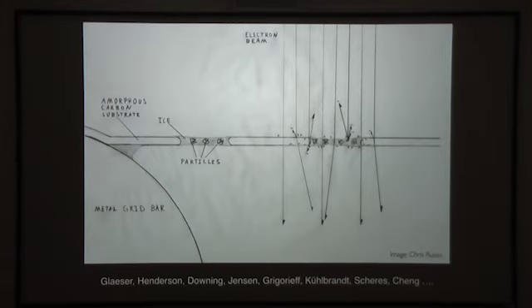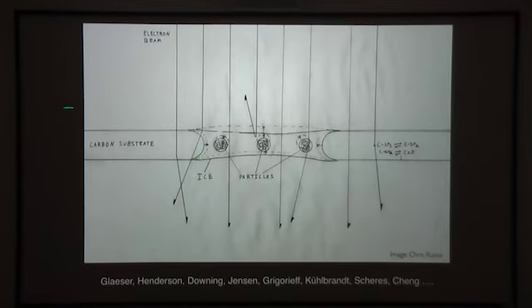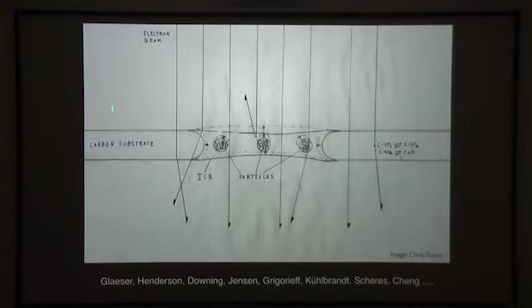So at this point, it's important to mention that the quality of our images at this stage is really important. And you've already heard during the course about radiation-induced motion. And this happens because when we image the specimen with the electron beam, bonds are broken both within the grid structure itself as well as within the ice. And this causes charges to accumulate and exerts forces on the sample such that the ice in the hole can bend and distort.